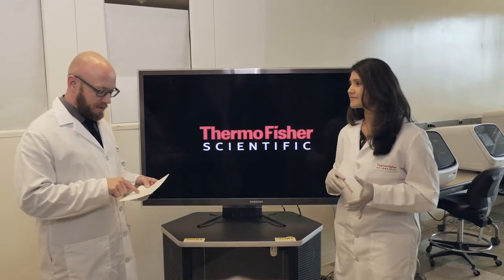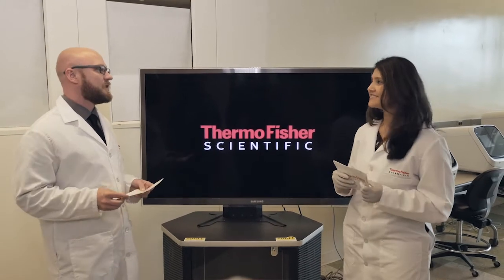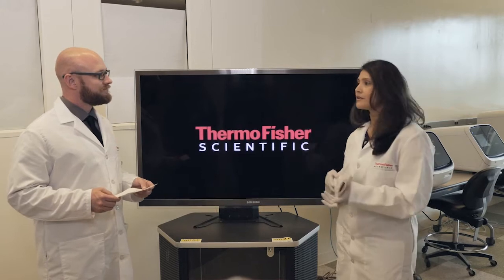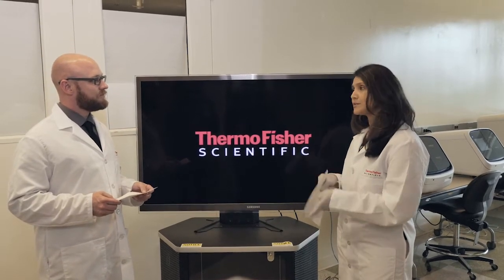Plates, strips, tubes — what's being used on the Seek Studio system? You can use a 96-well plate or you can use the eight-tube strip as well.